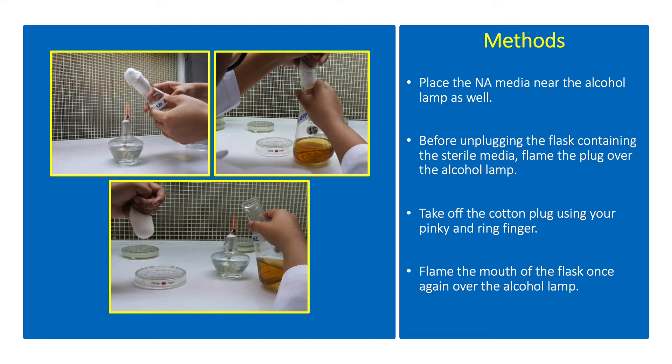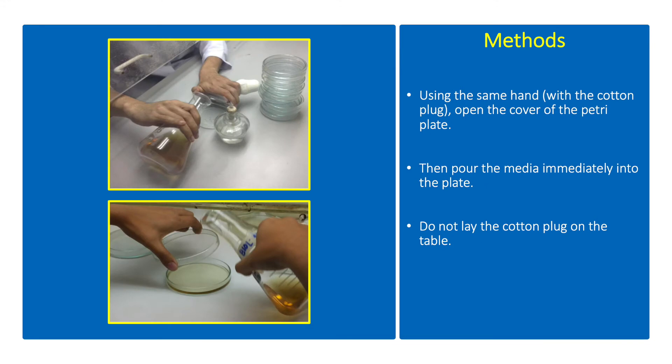Before unplugging the flask containing the sterile media, flame the plug over the alcohol lamp. Take off the cotton plug using your pinky and ring finger. Then flame the mouth of the flask once again over the alcohol lamp. Using the same hand with the cotton plug, open the cover of the petri plate. Then pour the media immediately into the plate.